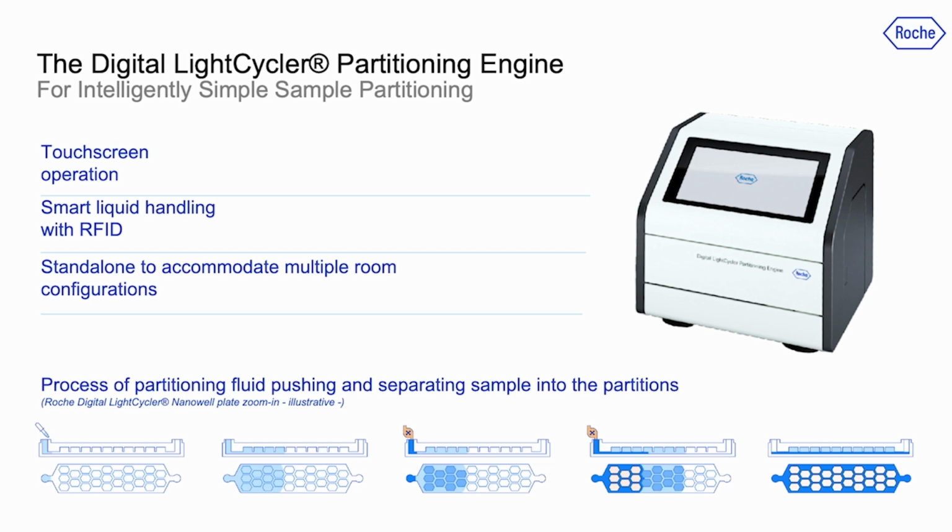Afterwards, this plate is placed one at a time into the partitioning engine unit, which will also input oil, or partitioning fluid, let's just say. That partitioning fluid will get disseminated by a pressurized base system in the PE itself. And as the pressurization mechanism is employed, it will move both the sample as well as the oil across the length of the lane, effectively sealing it all together entirely.